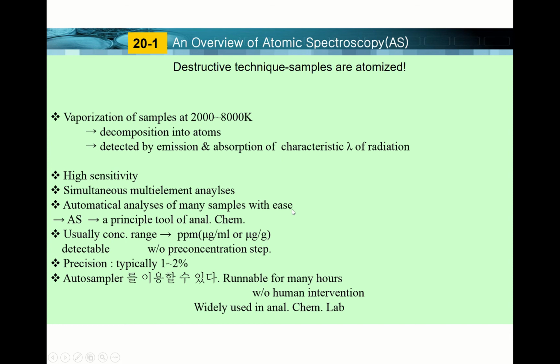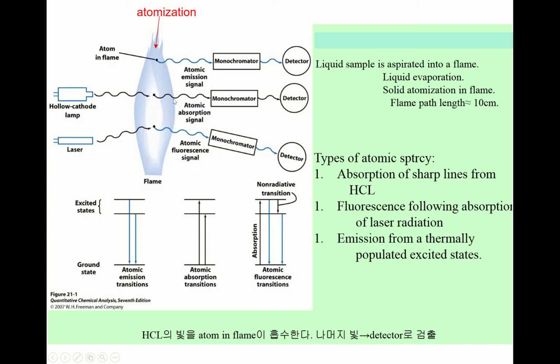But usually after atomization, we measure the emission, which is called atomic emission spectroscopy (AES), or absorption, atomic absorption spectroscopy (AAS), or you want to measure the fluorescence, atomic fluorescence spectroscopy (AFS). Here you'll see in detail.